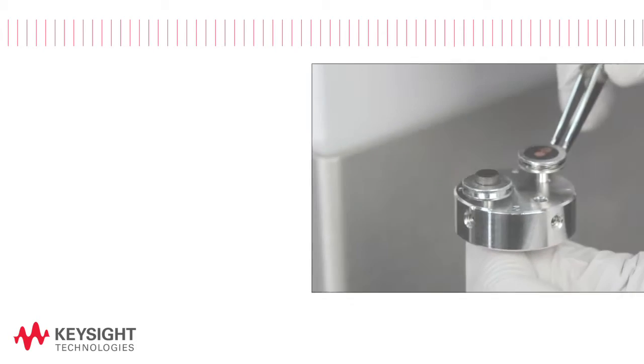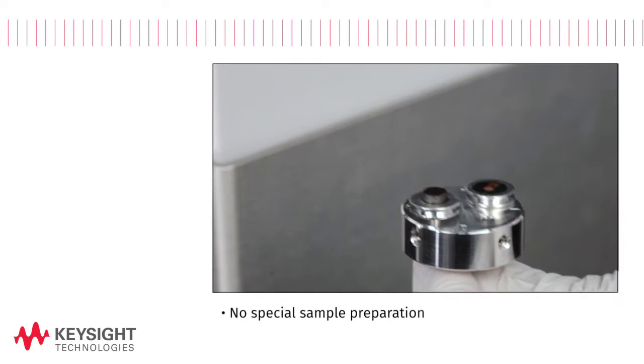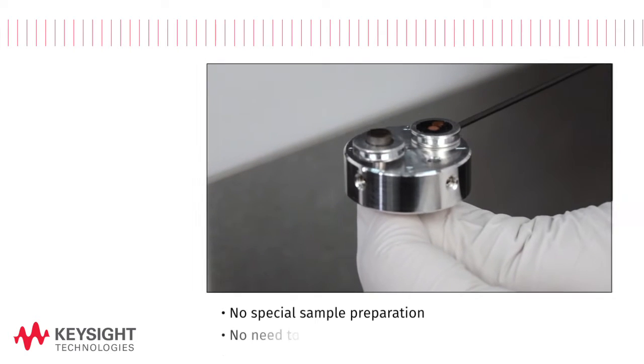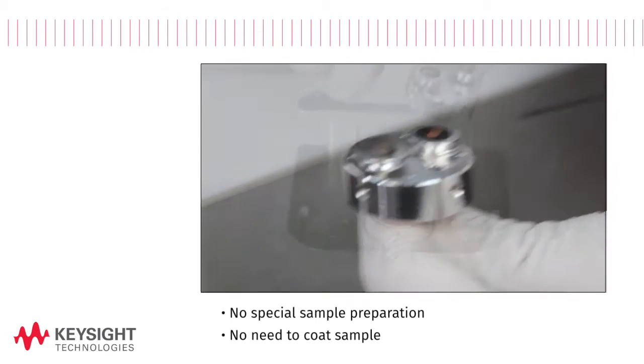There are no special sample preparation requirements for the 8500B and typically you don't even need to coat samples for imaging.